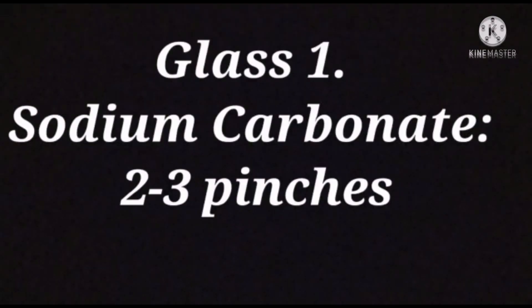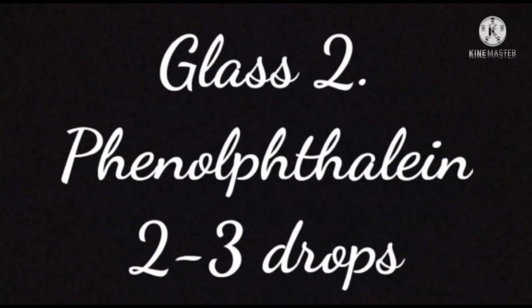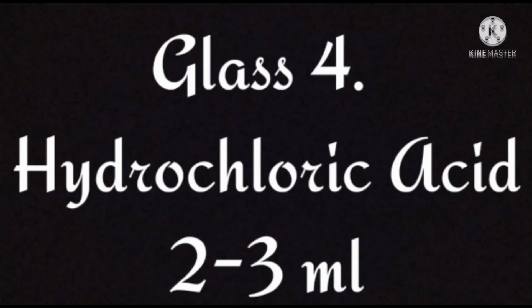That experiment was a success. So, in glass one we had sodium carbonate, two to three pinches. In glass two we had phenolphthalein, two to three drops. In glass three, barium chloride, three pinches. And finally, in the fourth glass, we had hydrochloric acid, two to three ml.